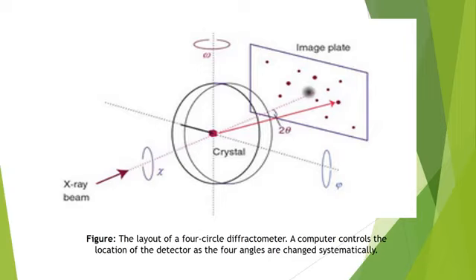Here is another layout of the process that takes place in the single crystal X-ray diffraction technique.